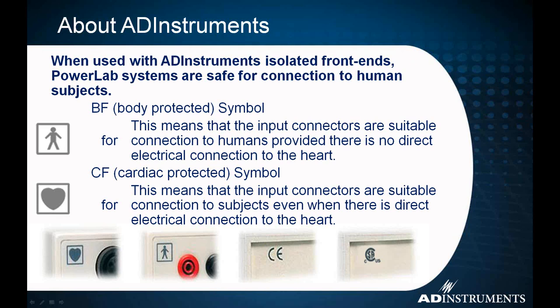But definitely be sure that before you connect to a human subject that you have this body protected symbol, or if you're doing a direct connection to the heart, that you have this cardiac protection symbol.